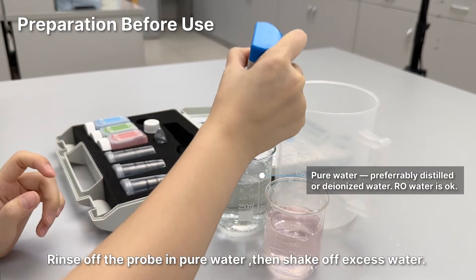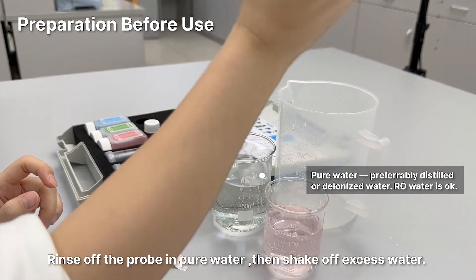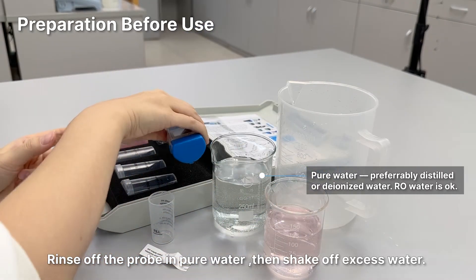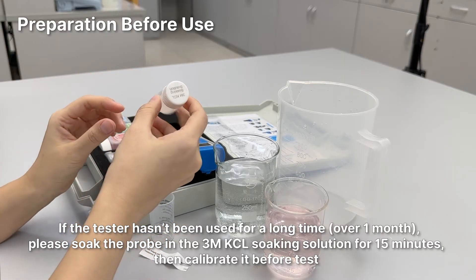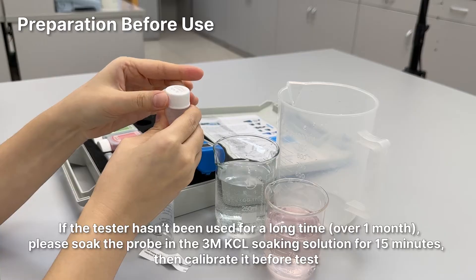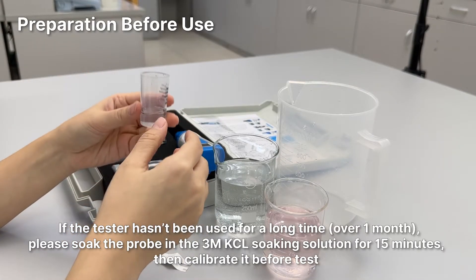Rinse off the probe in pure water, then shake off excess water. If the tester hasn't been used for a long time — over one month — please soak the probe in the 3M KCl soaking solution for 15 minutes, then calibrate it before testing.